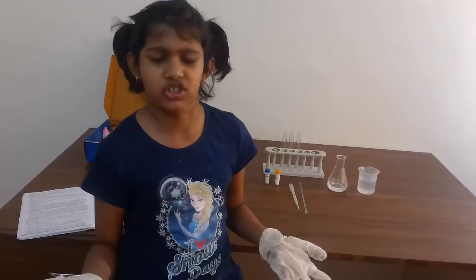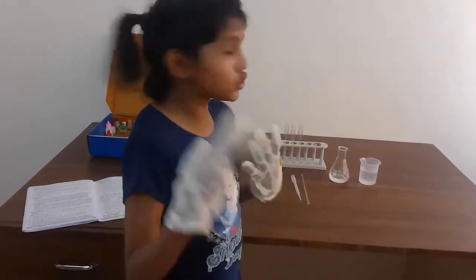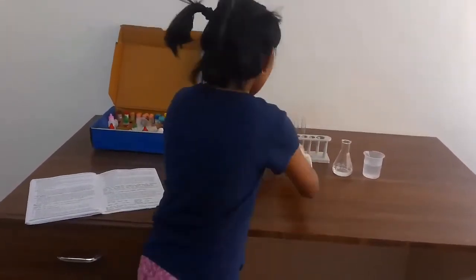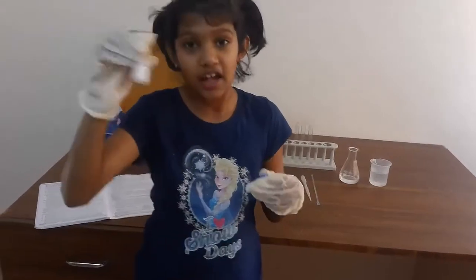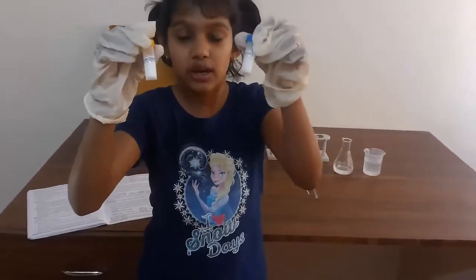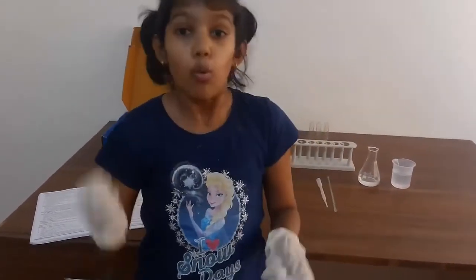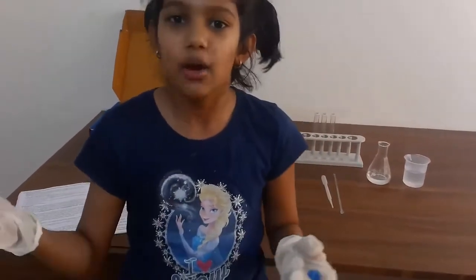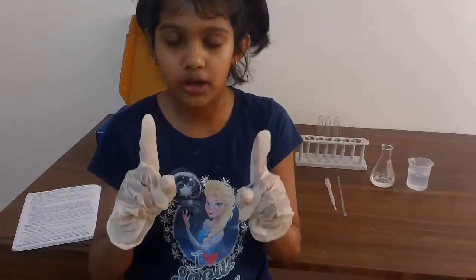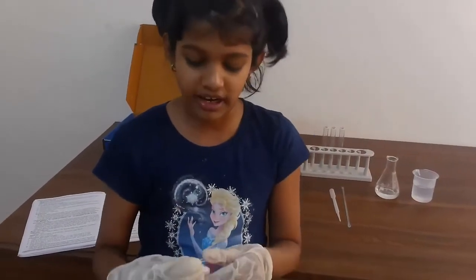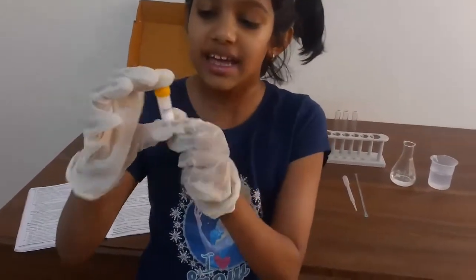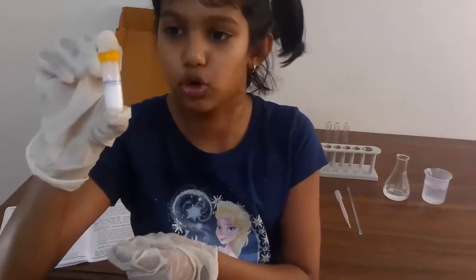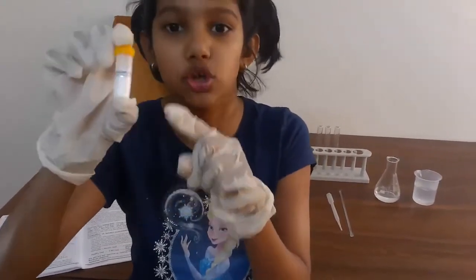What is this type of reaction? Well, it's when we have two compounds. Like over here we have calcium chloride and sodium carbonate. One compound, one chemical, is made by one metal and one non-metal. So over here the metal is calcium in calcium chloride and the non-metal is chloride.